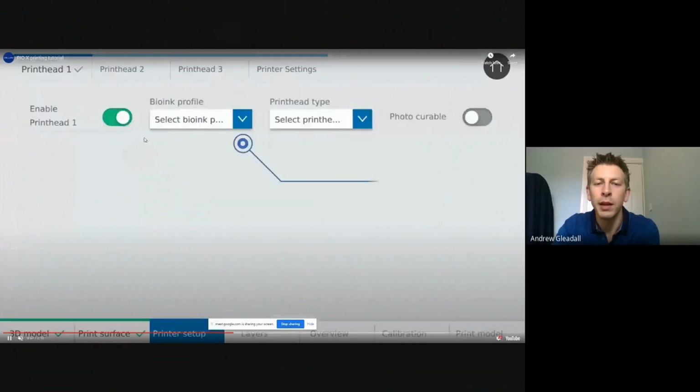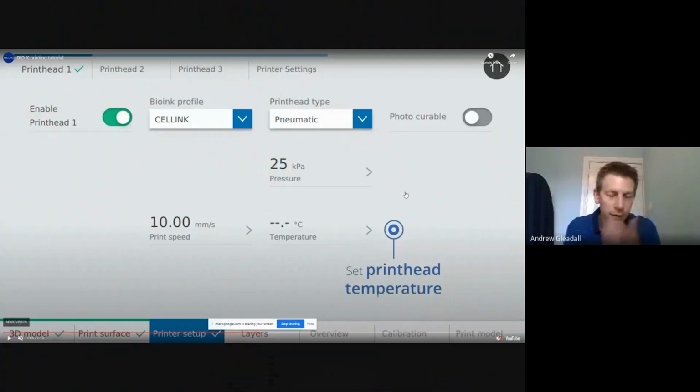So this is then saying you can choose your 3 different print heads, which ones you want to use for this model. And then for each print head, you can choose the material. So a common thing that you might use is one material just to create some support for the other material. So if we haven't got a nice flat bottom, for example, the ear, then you can't just print it in the middle of the air. You've got to print on top of something that's already there. So you might print the sort of mold of that ear almost underneath to support it when we print on top of it. I'll show you that in more detail in a future slide.